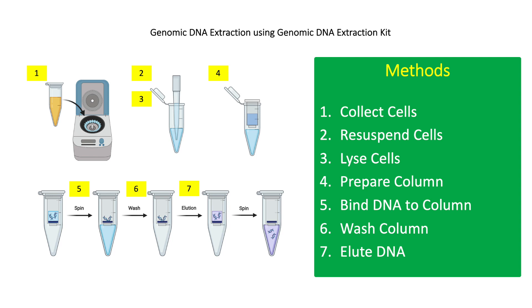For step 4, add 500 microliters of the column preparation solution to each binding column. Centrifuge at 12,000 g for 1 minute, then discard the flow-through.